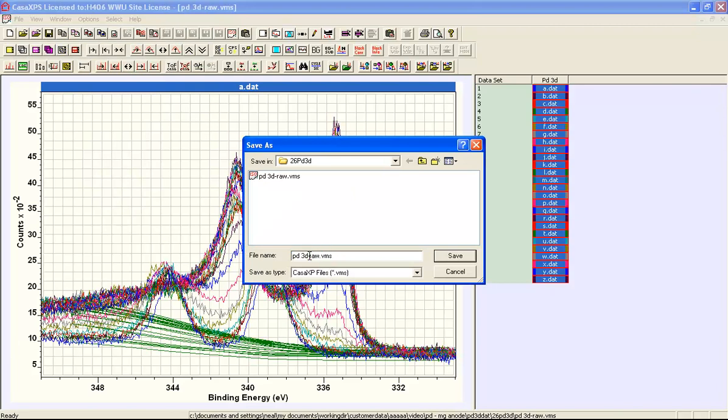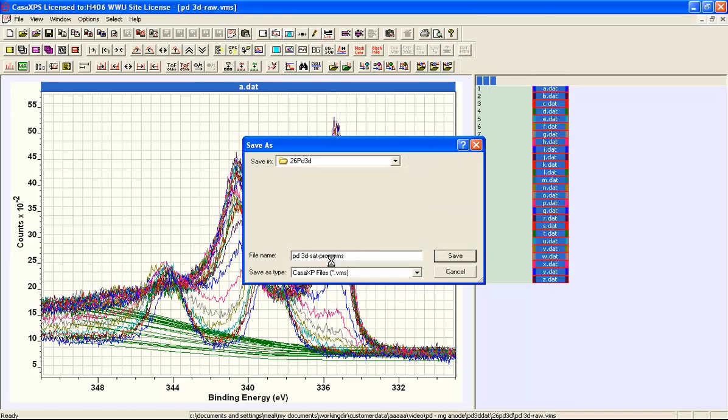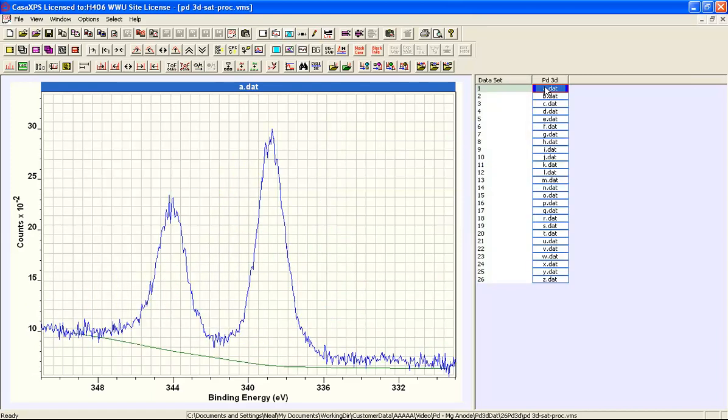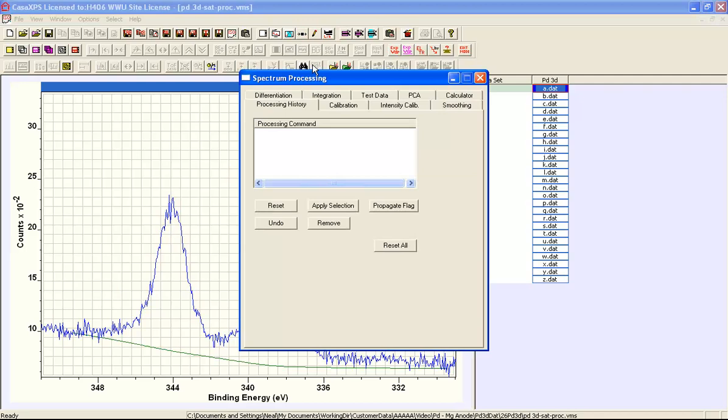And rather than calling it raw I'll call this processed. And the reason that I've saved this to a new file name is because when I use the processing history I'm not able to undo these data anymore.